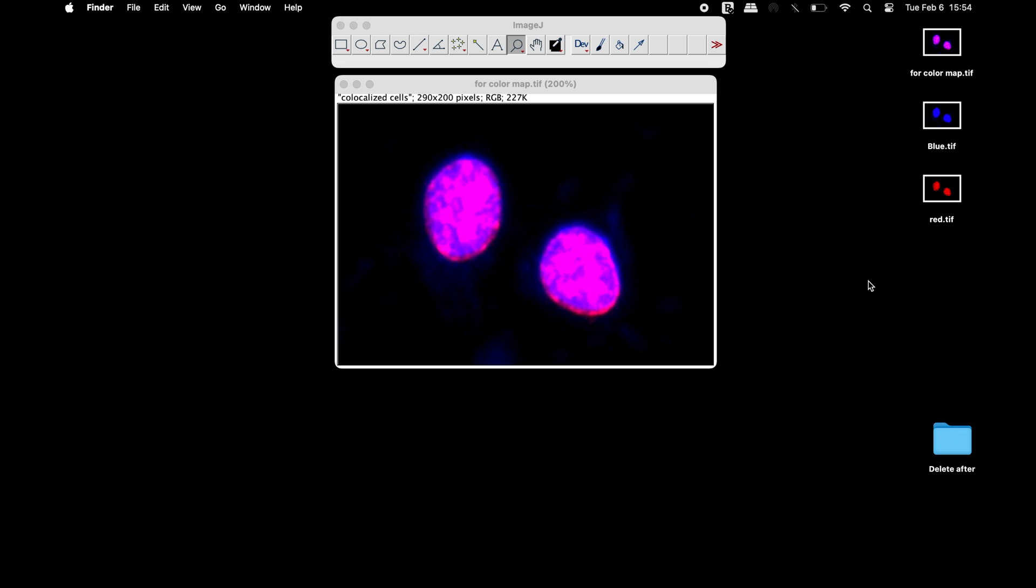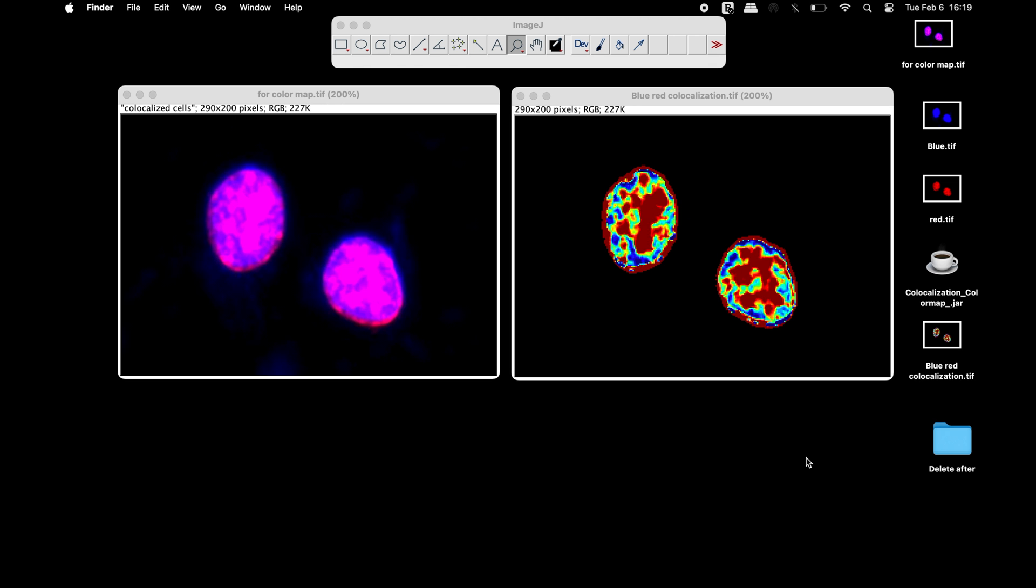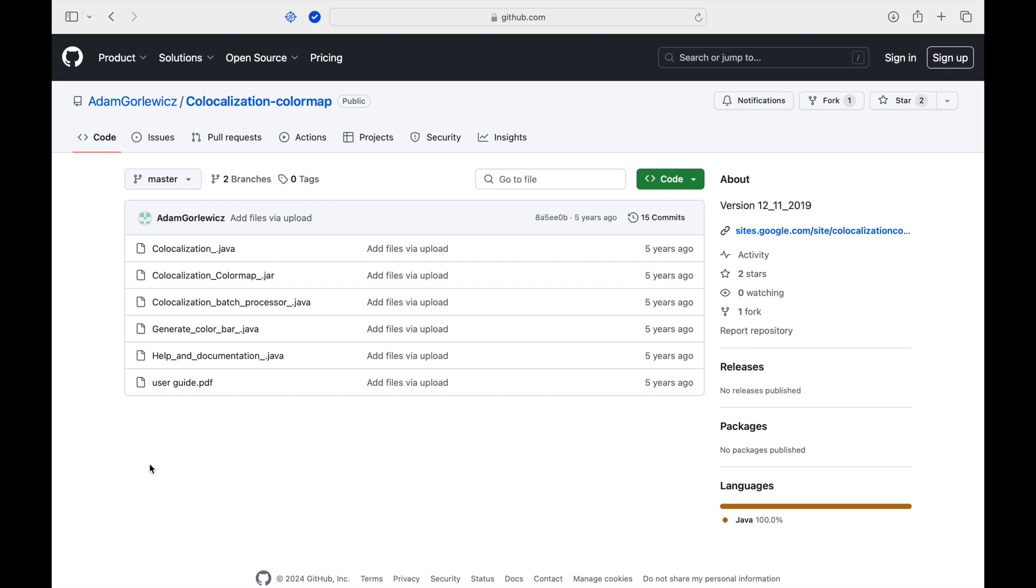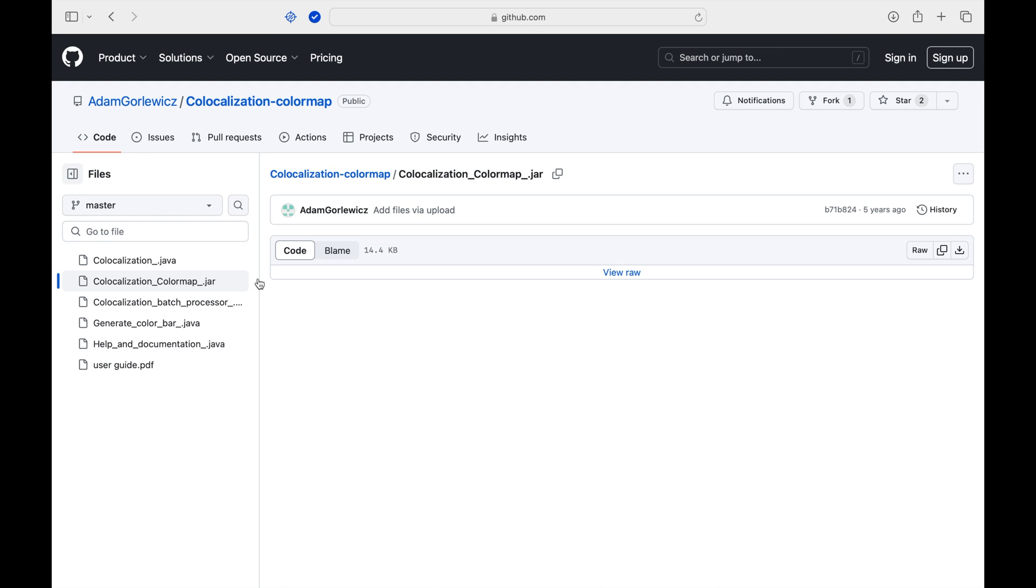We will use an ImageJ plugin to generate the color map representing a co-localization. Head to this website and download the co-localization color map plugin.